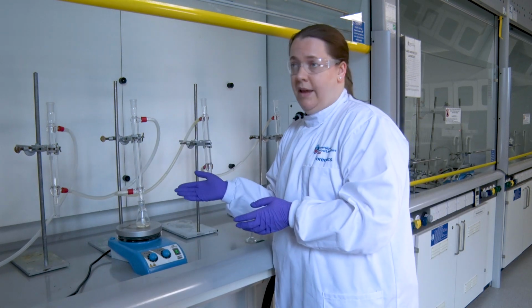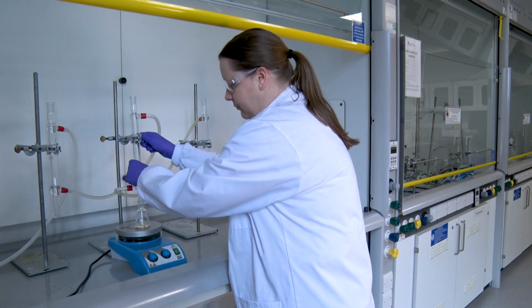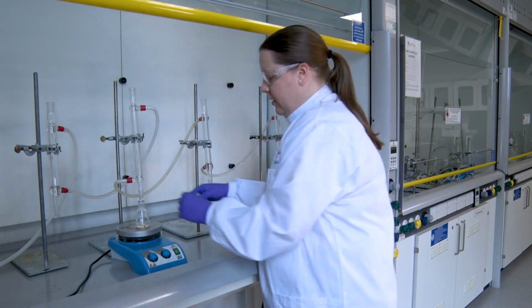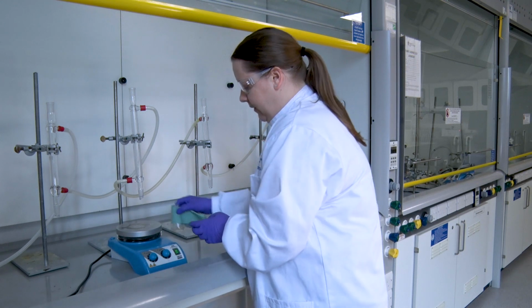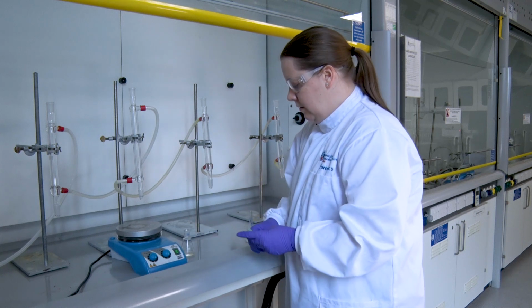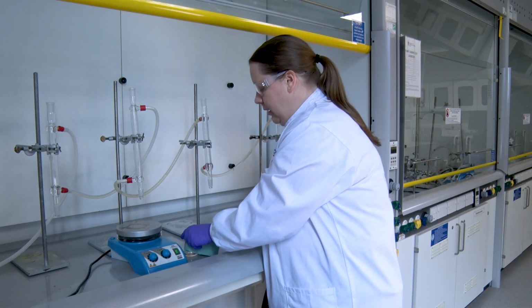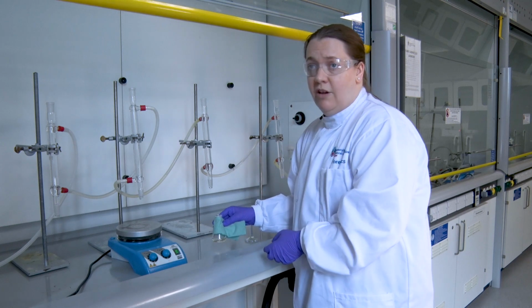Now it's time to take it off. So you lift the condenser and I'm going to use the paper cloth to lift the flask off, and then I'm just going to leave it there for a few moments to cool. And now you can take it to do the next stage of the reaction.